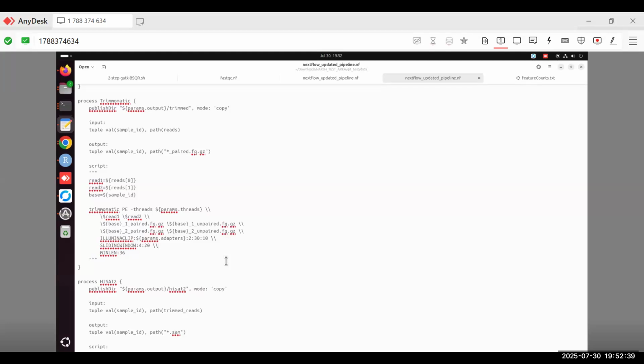Because this is a process of automation, right? So you have to define everything here. The first QC, then Trimmomatic, and then you can add the QC part again here if you like to, and then you can perform the analysis. Okay, thanks, ma'am.